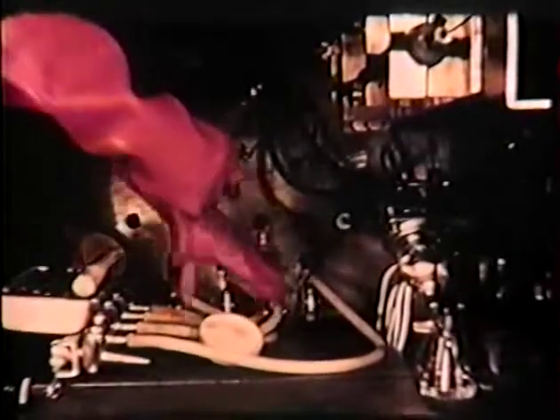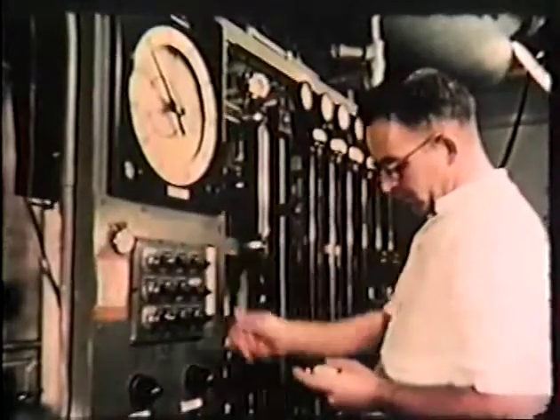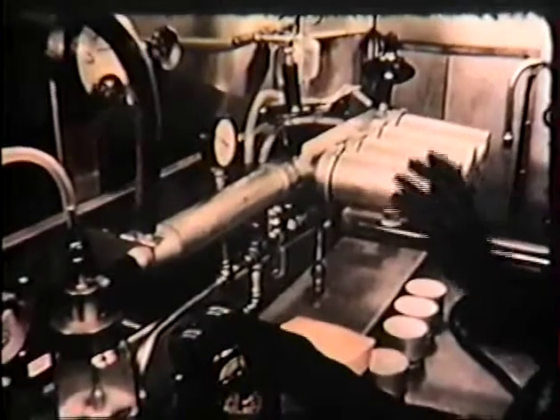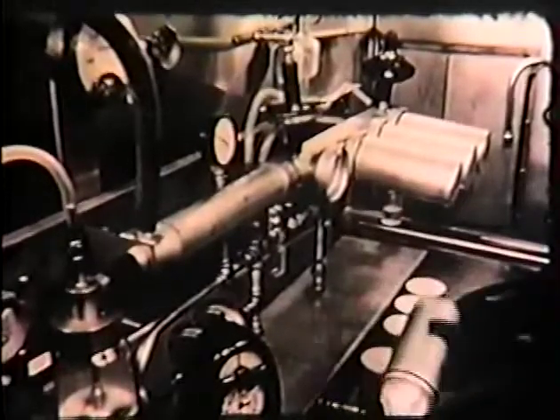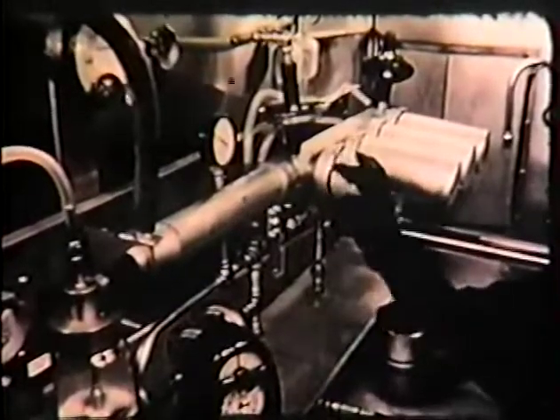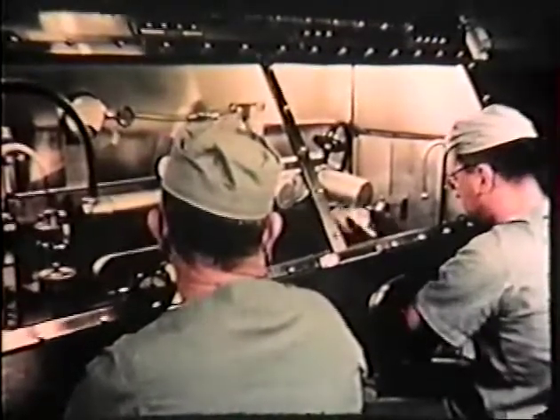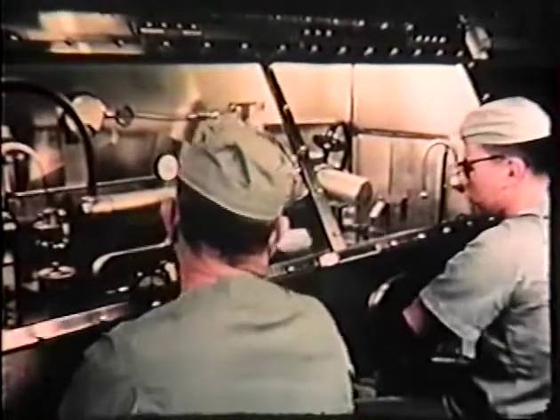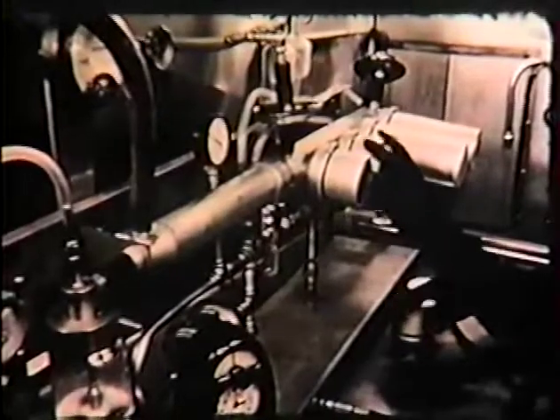Because a biological attack would most likely come in the form of an invisible cloud carrying the disease organisms, the study of these clouds, or aerosols, is important. One of the smallest test chambers is the Henderson, used to try out aerosols against mice and guinea pigs. Although limited to small-scale testing, quite a number of experiments can be made with this apparatus in the time it would take to run one test in any of the larger chambers.